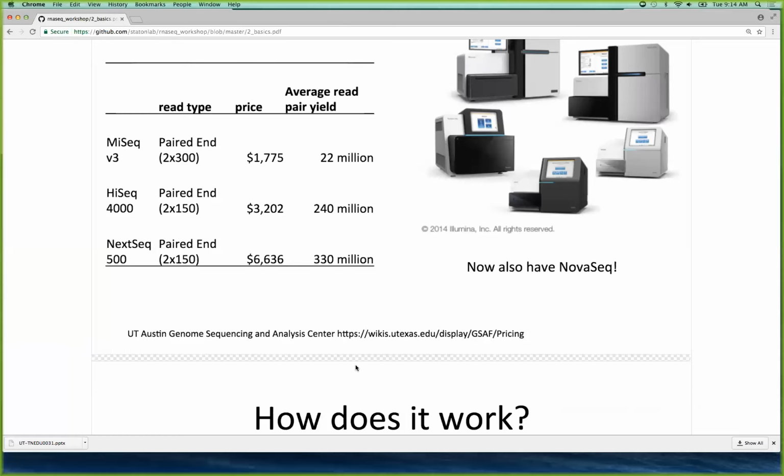So only a handful of universities has really invested. And like, we're gonna go into the sequencing game. We're gonna run a big core. We're gonna make this work. And you will see ones that maybe they have a one-off, like a single HiSeq or a single NextSeq. I'm wary of those because if the instrument's down, you have to maybe wait months for it to be back up and get your sequencing data. And a lot of time they're subsidized by the university, which is great.